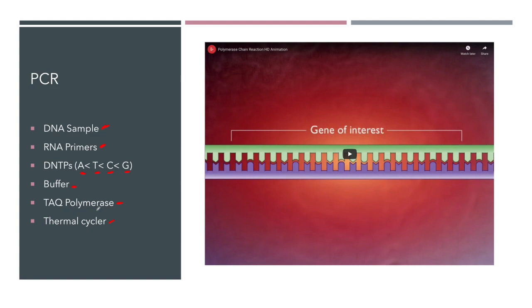What's really great about PCR is that the PCR they are using in the hospitals right now can diagnose COVID. They're looking specifically for DNA sequences that are found from COVID. COVID is an RNA virus, so they reverse transcribe the RNA into DNA and then use the PCR to look for those DNA sequences. And in that particular case, they can diagnose COVID in a matter of hours. Okay. So I'm going to show you a quick video that shows you how polymerase chain reaction works.